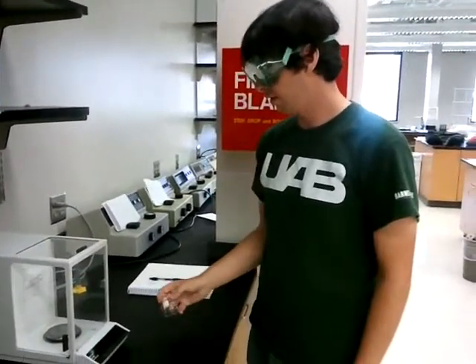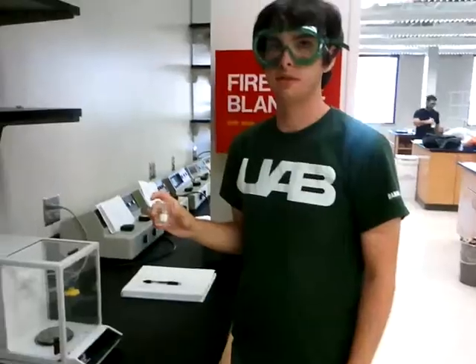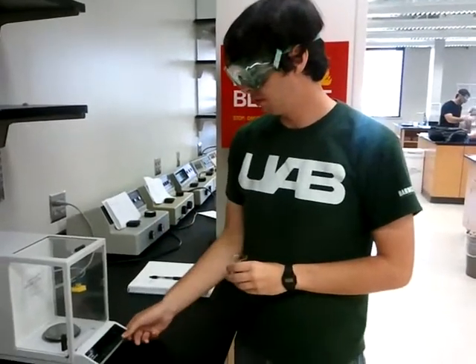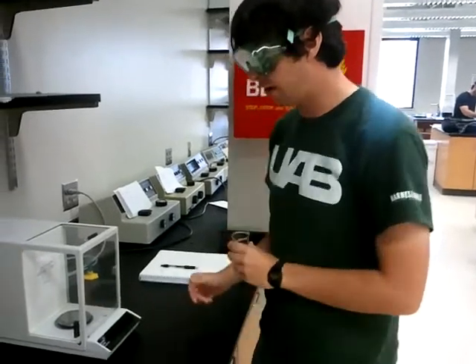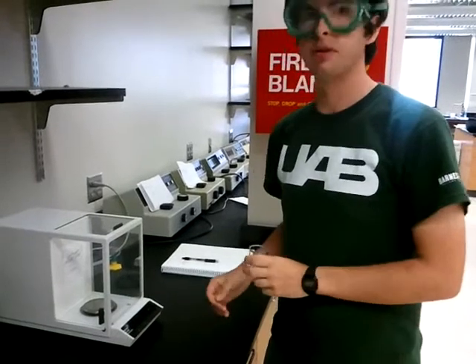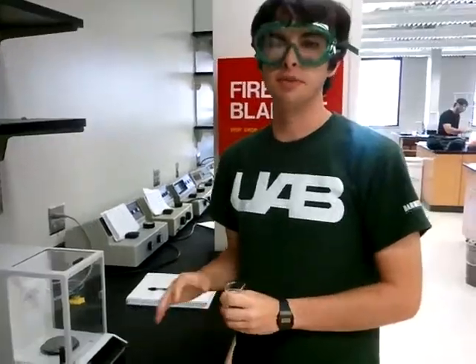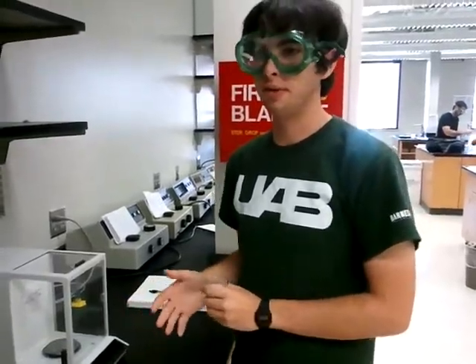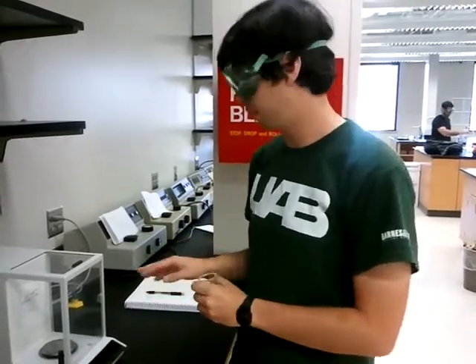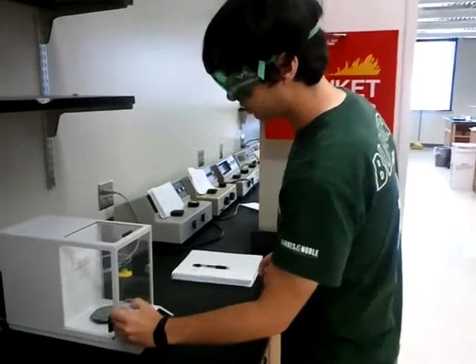Okay. So today, the measurement of the beaker on the analytical balance. The first step is to turn on the analytical balance and zero it. You want to make sure you use the same balance for every one of your measurements, because every balance has a slight error, and between balances you're going to get deviations.